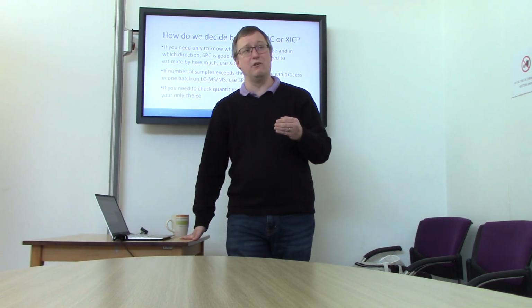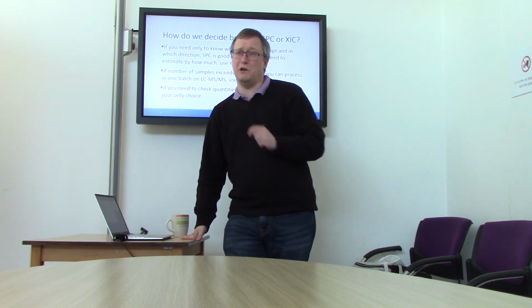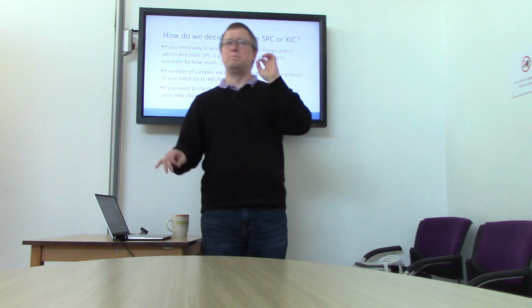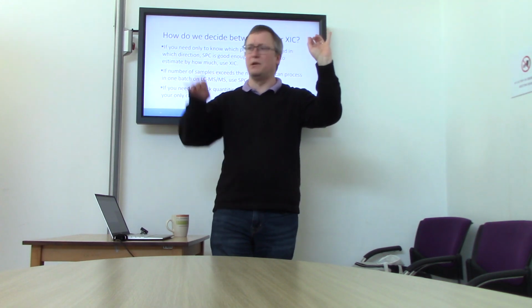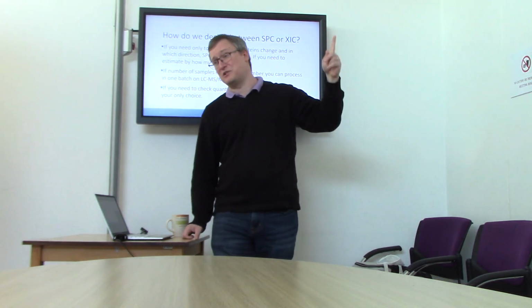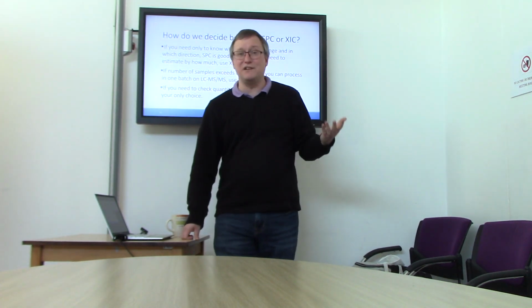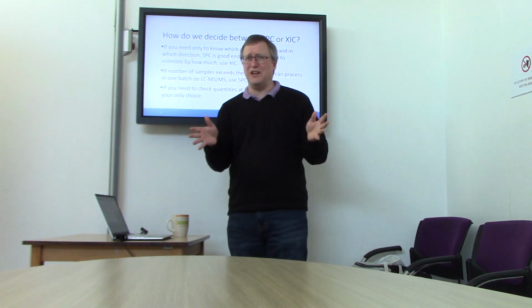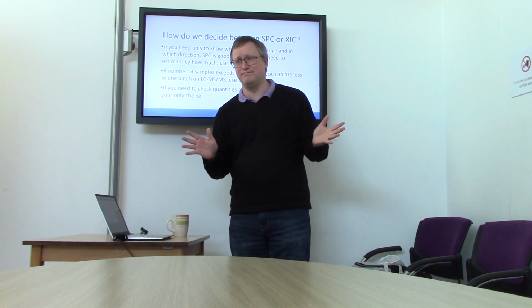It might be, though, that you have a much more quantitative question in mind, which is not just which ones are up and which ones are down, but by how much. Is this up 20%? Is it up 400%? If the only protein differences you detect are up by 400%, you're limiting your power quite a lot. So these questions actually matter. It might be enough for you to know these proteins are up, in which case spectral counting is a completely fine way to go about it.